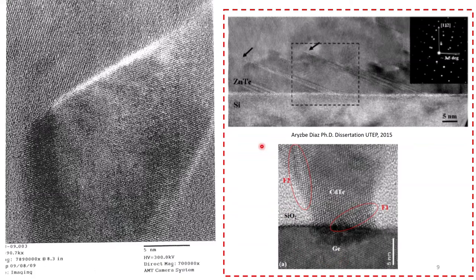What's really neat is that SiO₂ is amorphous, and we can actually see amorphicity on a TEM micrograph. You can see the ordered-ness of the cadmium telluride and germanium — the rows of atoms are visible — but for the silicon dioxide there's no real order. So SiO₂ is amorphous, CdTe is crystalline, germanium is crystalline. All seen with a TEM. Real space images alone tell you cool stuff; real space images with reciprocal space diffraction patterns tell you even more.